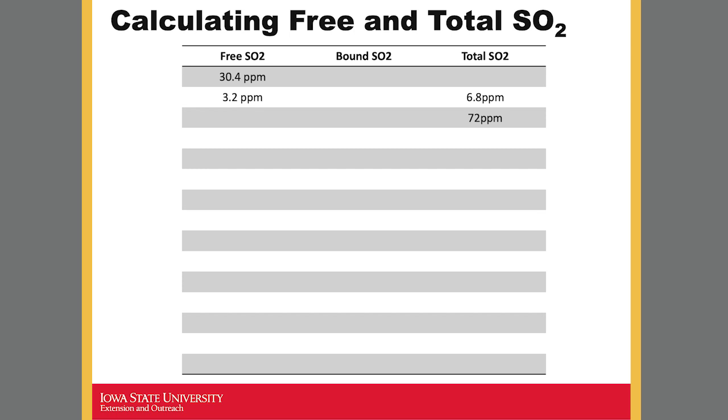Also, as I explained a little bit earlier, acetic acid is volatile, and that can interfere with the calculation of the concentration of free SO2 and total SO2 overall. Also, anthocyanins can lead to some overestimation of free SO2. But that's just something you need to know.